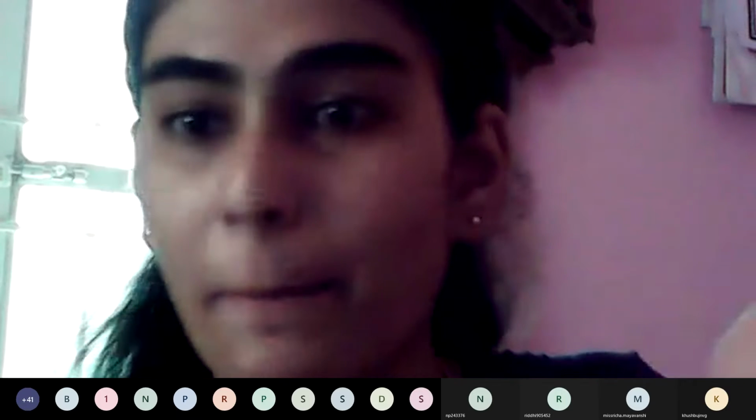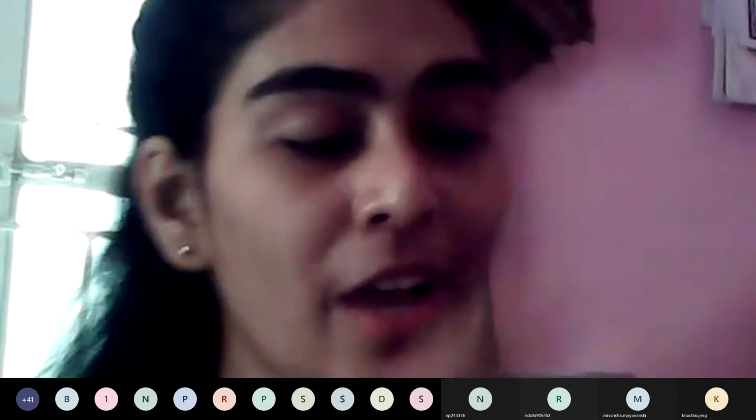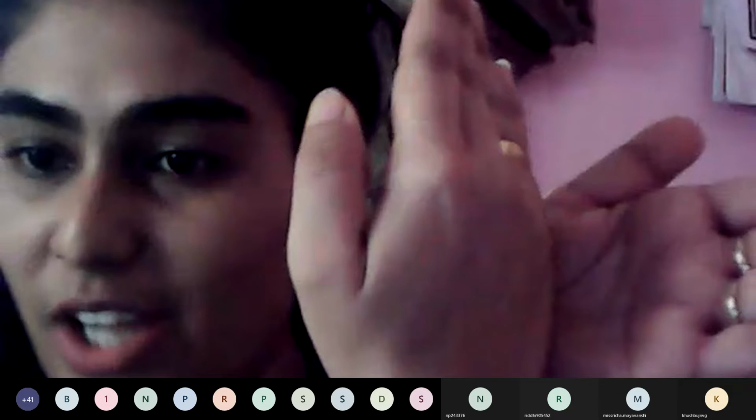Even if we don't keep the dots, it's okay. अगर हमें पता चलता है dots इसलिए, so that between two spots we will have the same space, like if we have 4 compounds, 4 spots, तो हर दो spot के बीच में we will have the same distance. So when it will actually move ahead against the gravity, जब वो ऊपर जाएगा तब उसको ऐसे जाना चाहिए, स्ट्रेट जाना चाहिए.